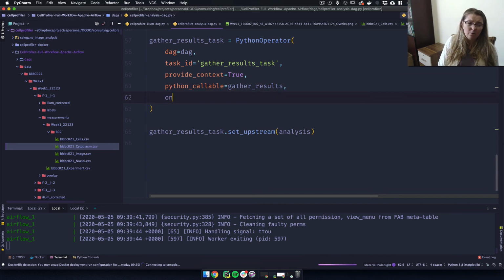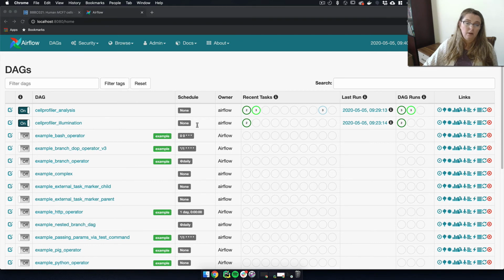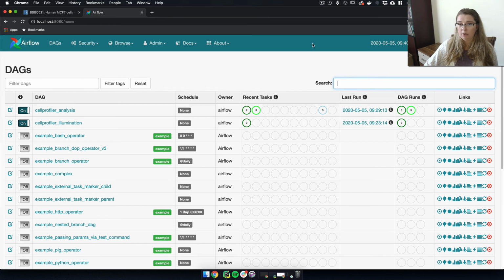There's also, of course now I don't remember what it's called. Oh, my computer is really freaking out here. Okay. I don't know what it's not liking. But anyways, when you have each of the operators, there's a success and failure callback. So if something is successful, you could alert somebody, you could update your project management system, or if you have a lab wiki or anything like that, you could update that programmatically. There's a lot of cool things that you could do.